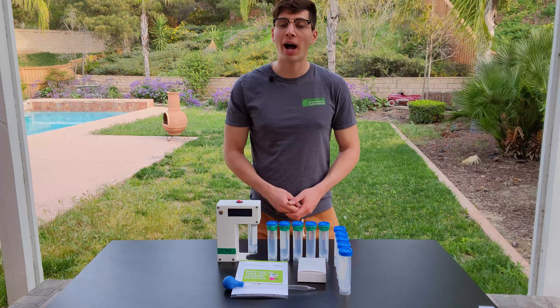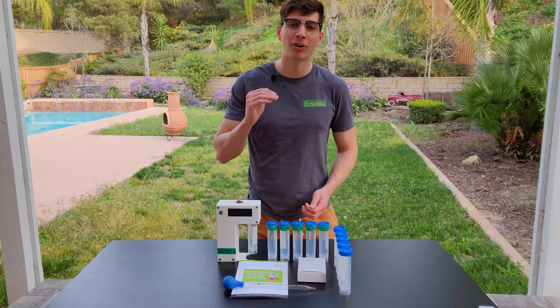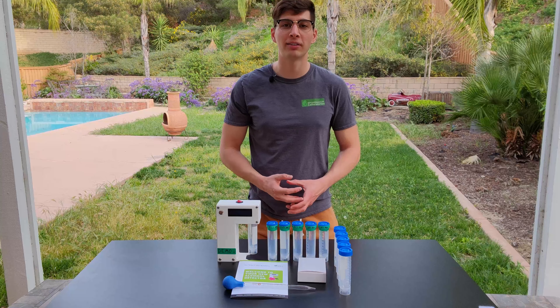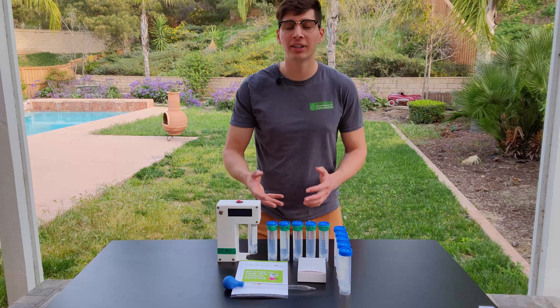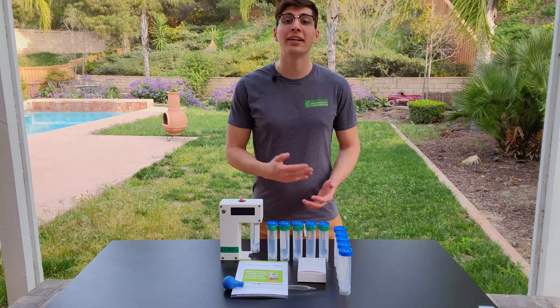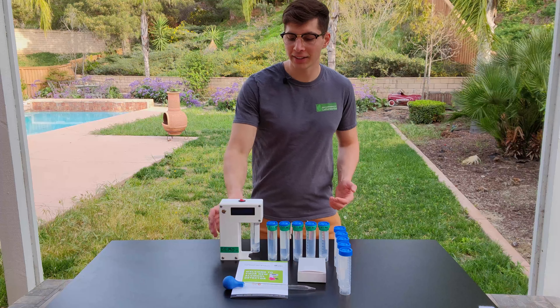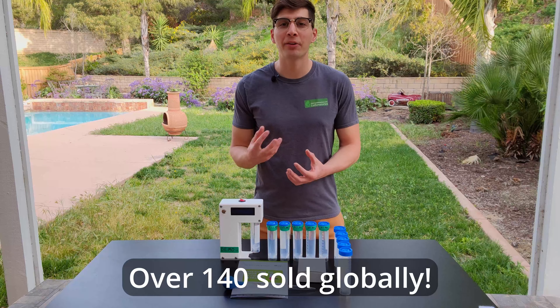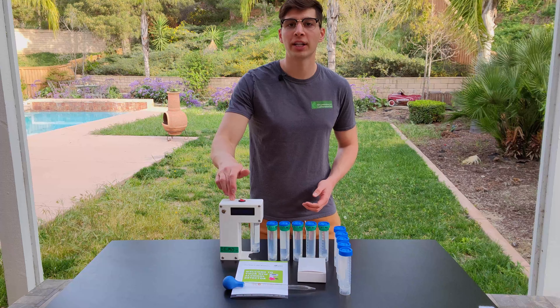About four years ago, I was brewing and selling kombucha at my local farmers market when I ran into the 0.5% alcohol content limit in the United States. After doing some reading and seeing all the lawsuits that were taking place over alcohol content in kombucha, I decided to try to build a new improved device that could more accurately measure alcohol content. I spent about a year building my first prototype, and now I've spent about three years selling alcohol content detectors to mostly the kombucha industry. Throughout those years, I've been gathering feedback and have finally implemented all of those changes in this new model.